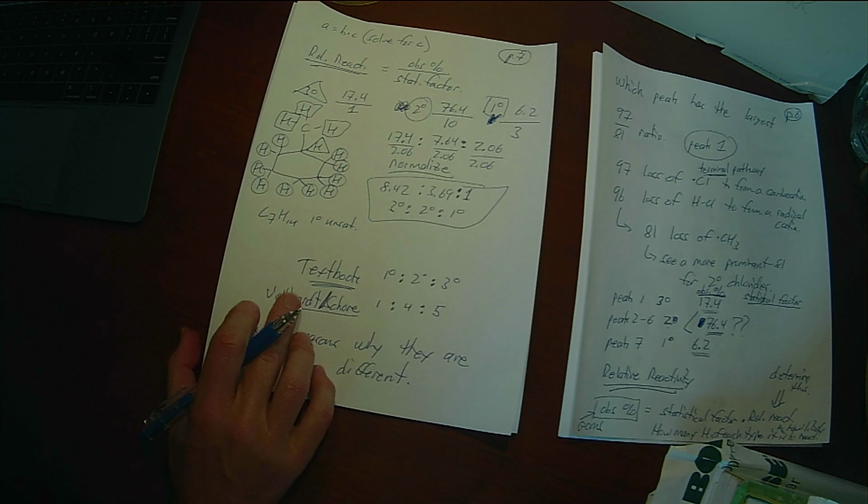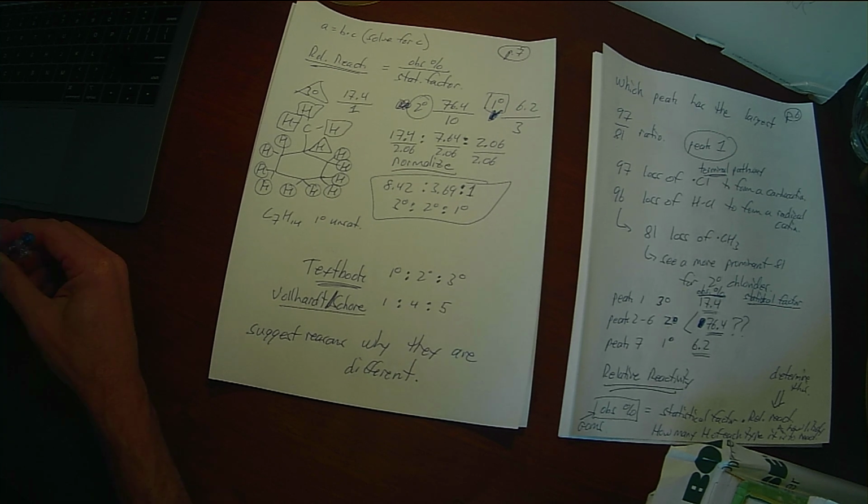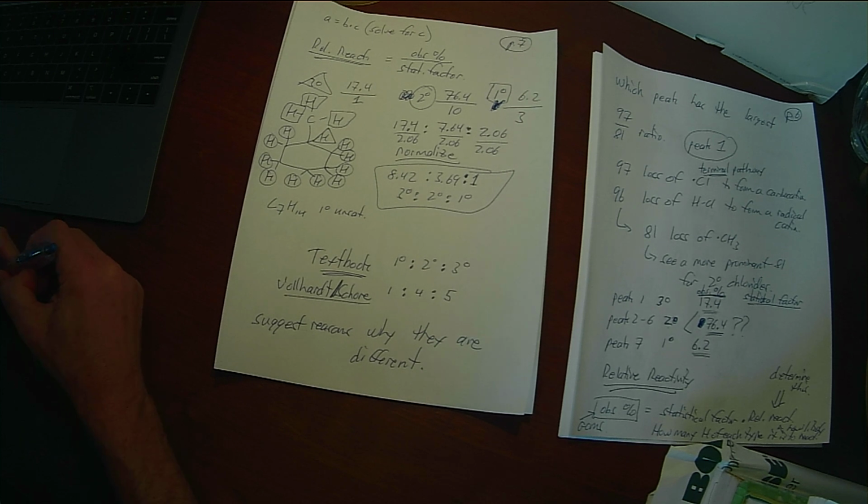And then you'll want to also use the boiling points with the reference for the boiling points. A lot of you had the bad reference for the boiling point, so you'll want to correct it to the one that I showed you on the grading checklist. So you use the right boiling point, right? For identifying your peaks, it would be appropriate to have the table in there.